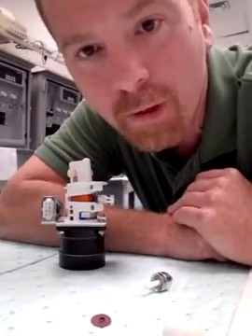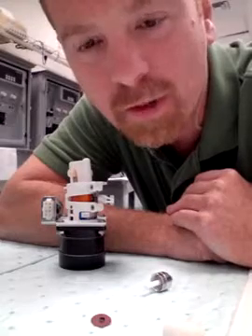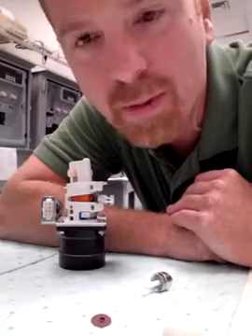Hello, this is Alan Provo for Galvanic Applied Sciences. Today I'm going to show you how to replace piston pump seals.